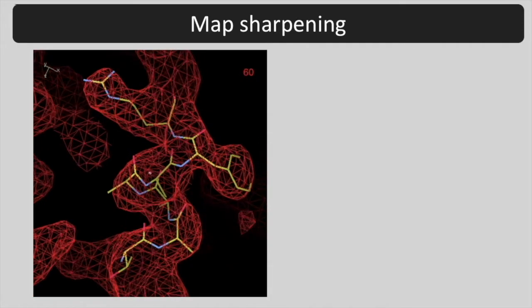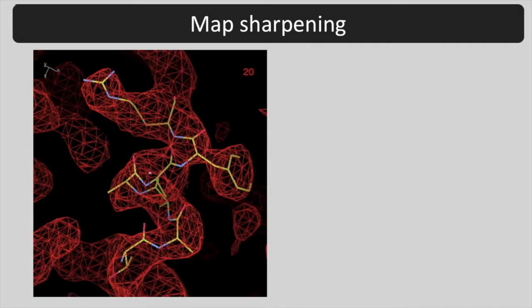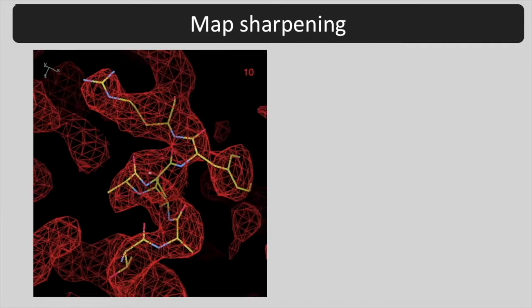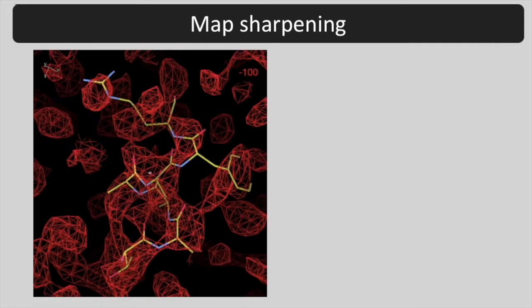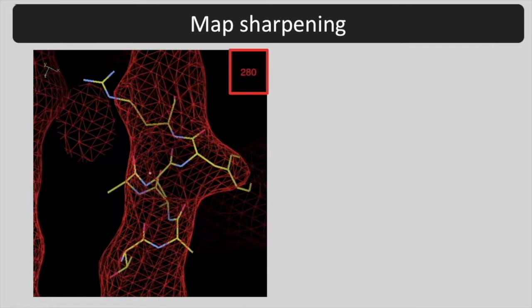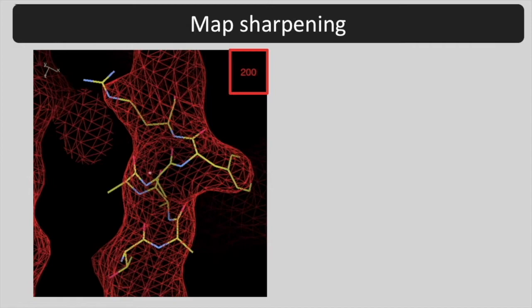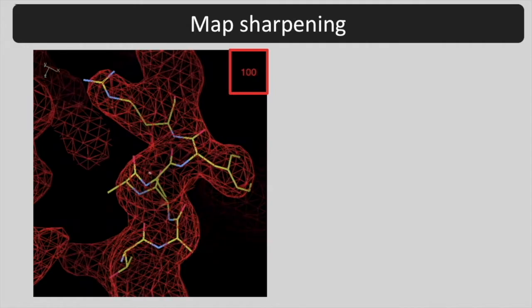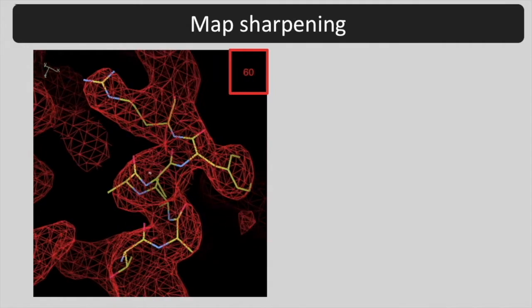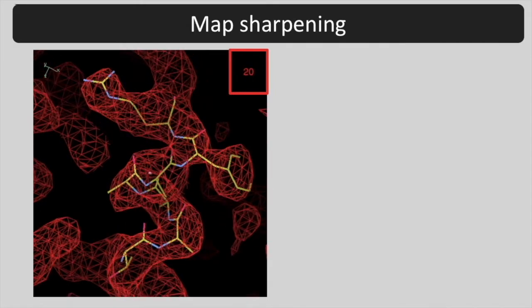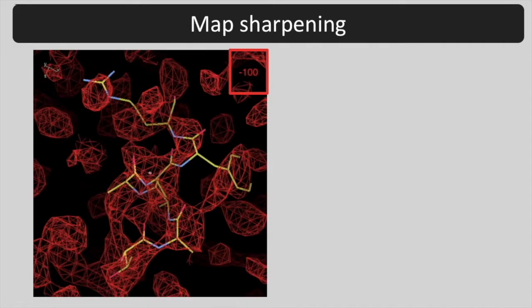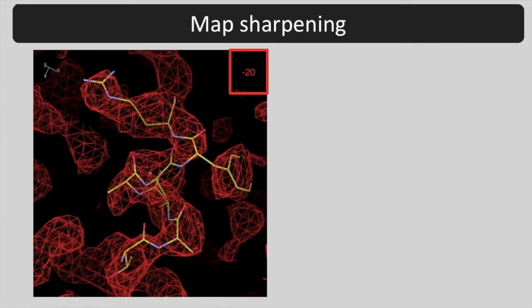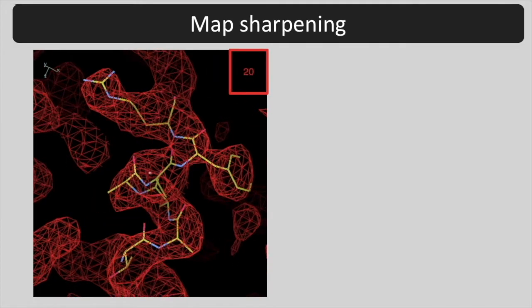As the map is sharpened, the clarity initially improves but eventually becomes worse as the connectivity is lost. The numbers in the upper right corner indicate the final B iso of the map, a measure of its sharpness where lower means sharper.